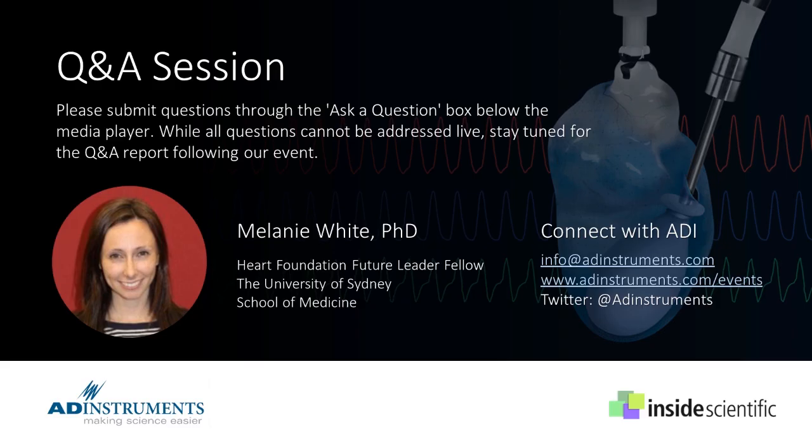And we've got that baseline period to see how that diastolic pressure is reducing. We definitely don't want it to go negative. It makes it difficult to calculate an LVDP, but that's why we have it there. We can always reinflate the balloon if we find that the diastolic pressure has dropped a little bit too far. So it's a consideration. Okay, excellent.